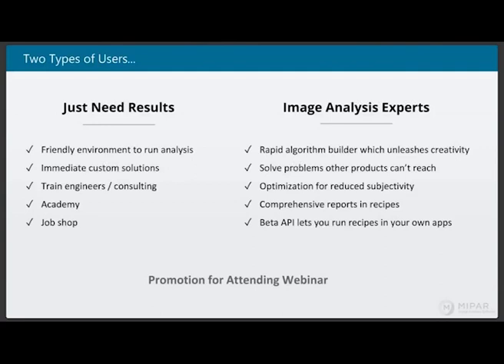We are growing as quickly as we are because while we do well with the simple problems, we have consistently been able to enable our users to automate image analysis problems that other products couldn't get to. And that's where the real excitement happens. You saw the optimization engine to take out subjectivity in some of the key steps. You saw how you can build reporting into the same recipe and deliver that to your users to run in one drag.